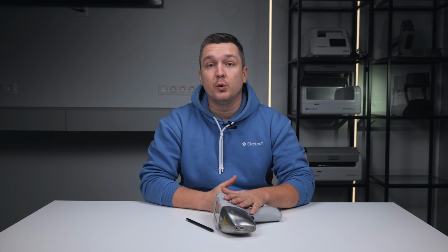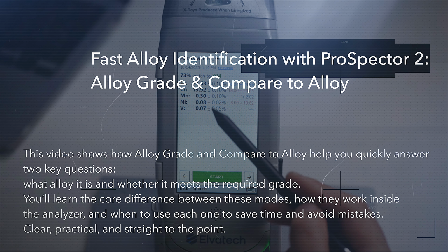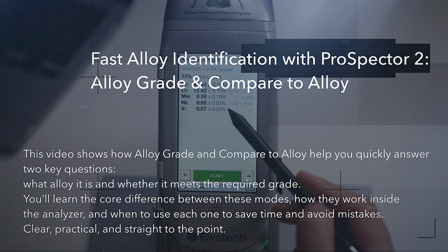My name is Serge and today we will talk about two functions in the ProSpector 2 XRF analyzer that make alloy identification much faster and easier. The first one is alloy grade and the second one is compare to alloy.